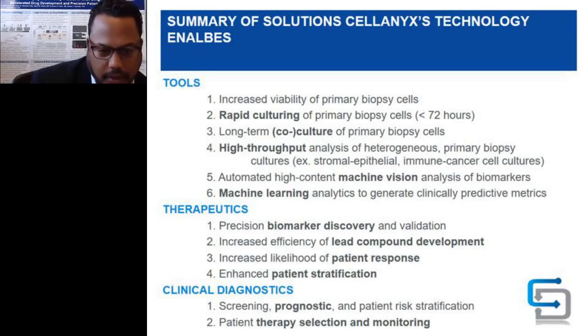High throughput analysis, and then most importantly, the objective analysis by machine vision and the predictive capabilities of machine learning really take and move what might be considered a very old idea of phenomics into a very relevant and actually perhaps even more important stance.